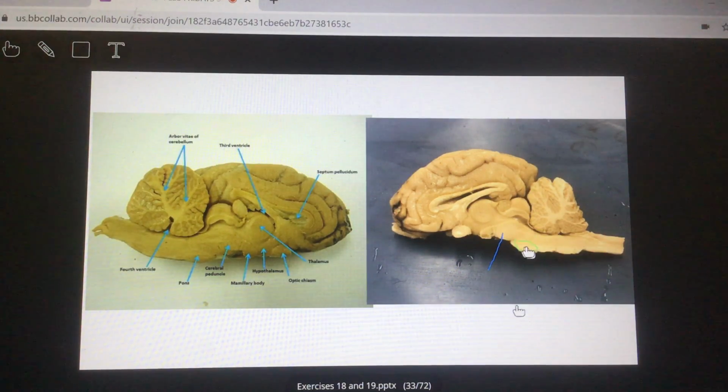Yeah, see, yep. See how that bumps out a little bit there? That's the pons. And you can go back a little bit towards the cerebellum. Yeah, but that's fine. Just to focus on that. That's fine. All right, guys. Medulla oblongata. Down, down, down, down, down.